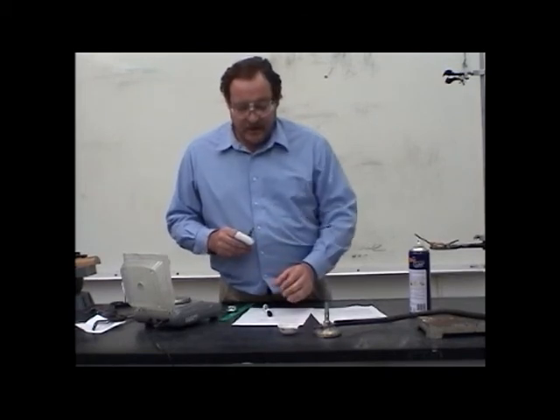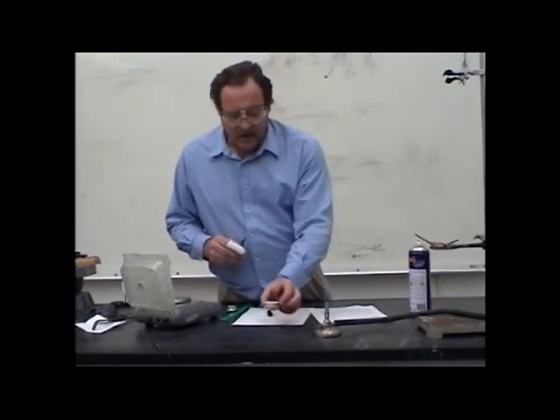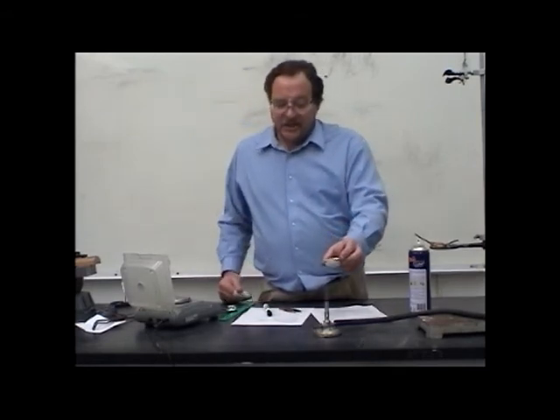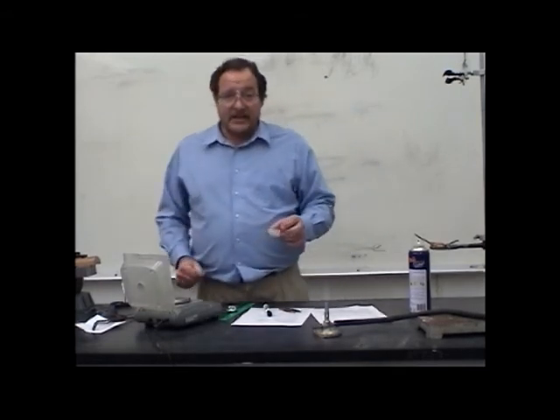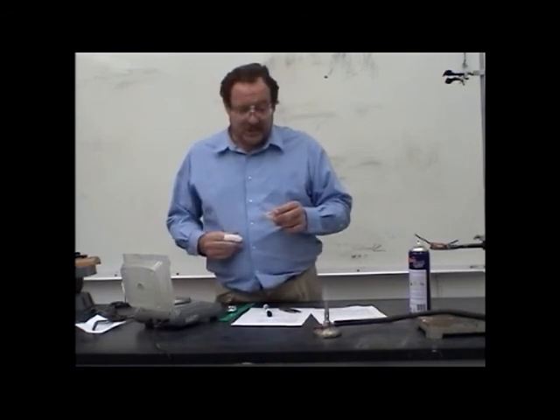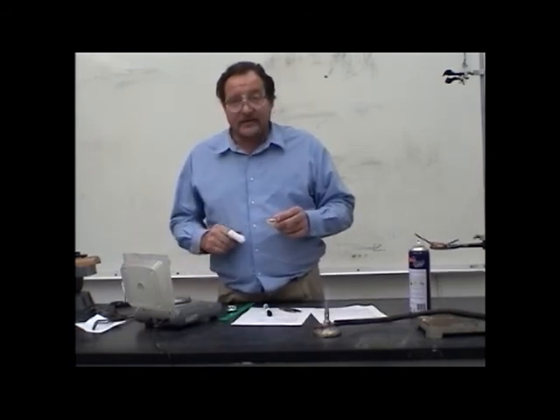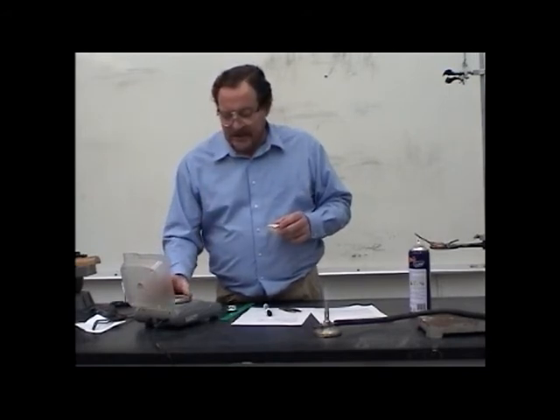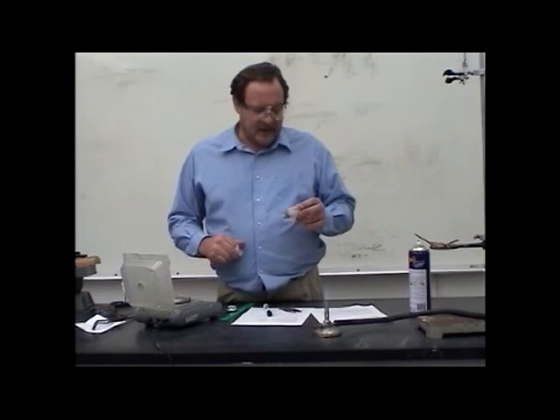Now, this burnt fine. Now, I'm going to take my evaporating dish. If by chance you heated it up and the evaporating dish is hot, never ever put a hot evaporating dish on the scale. It won't measure correctly and it could possibly risk warping the plate on the scale. So be careful as far as that goes.